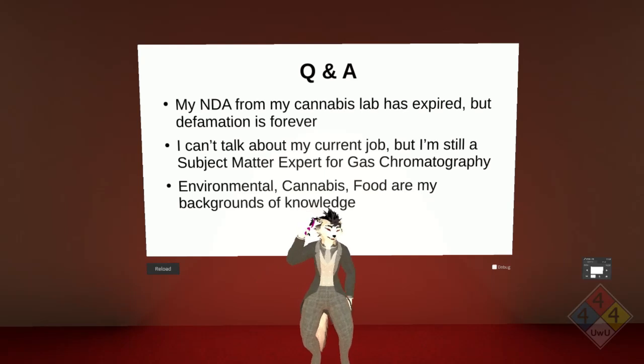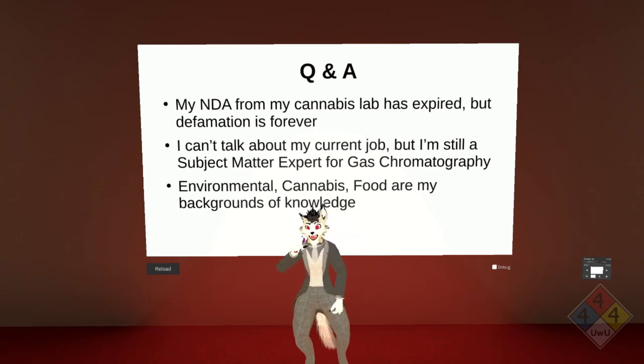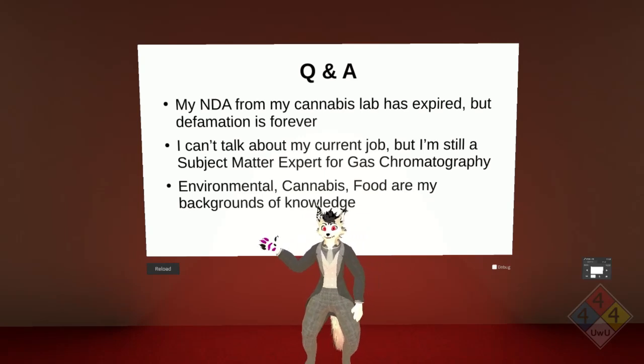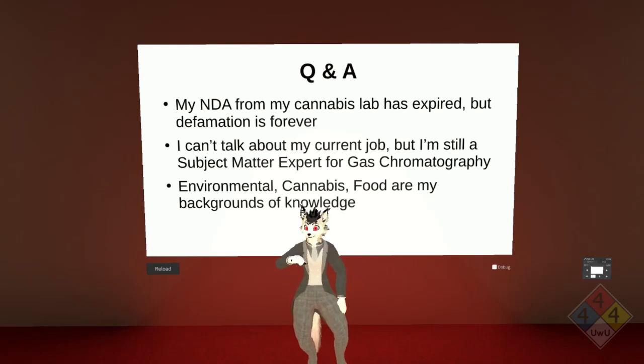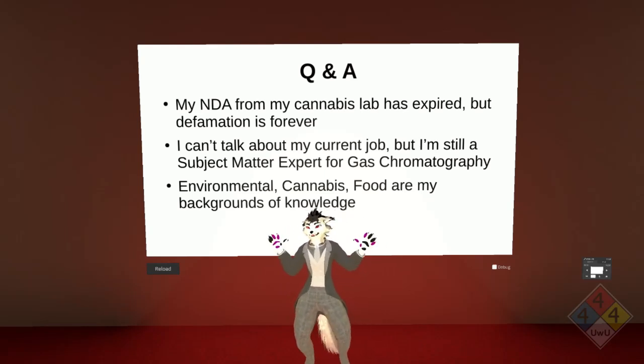And not to mention, if you want to sit down and do the mathematics of how many molecules are hitting the detector, granted, 10 to the 23rd is a massive number, and the number is still going to be many thousands, but it's still a very small amount of physical material hitting these detectors. So if you want to just stick a syringe and squirt it and see what happens, I wouldn't recommend it. You're going to need to do something to limit the flow onto the systems. But the technical answer is yeah.